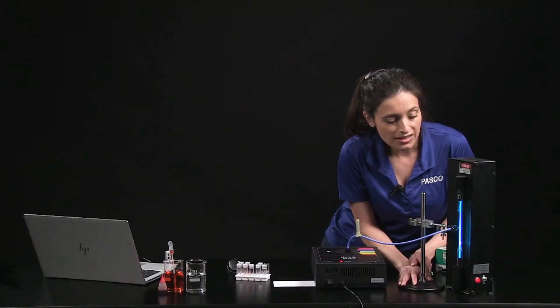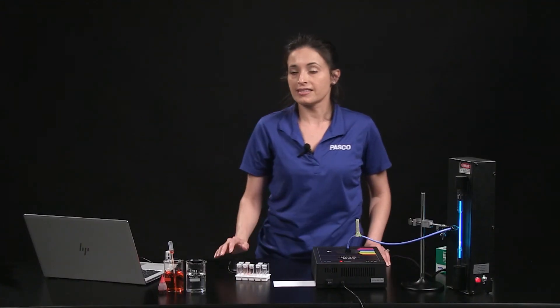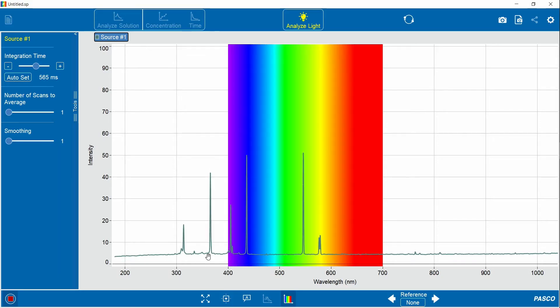Let me adjust the distance and position. And I can improve the signal if I auto-set the integration time to eliminate background noise. The software does this automatically. There we go.